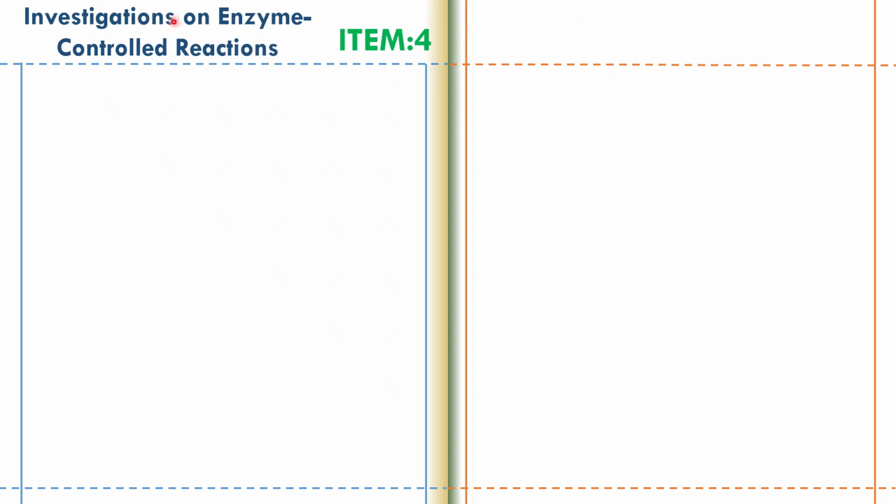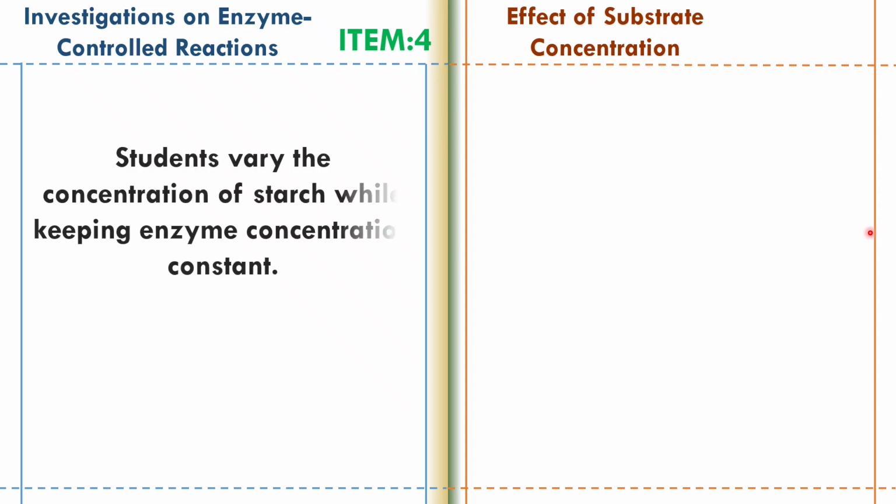Investigations on enzyme-controlled reactions. Item 4. Effect of substrate concentration. Students vary the concentration of starch while keeping enzyme concentration constant.